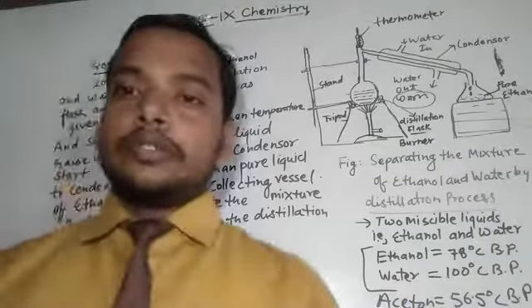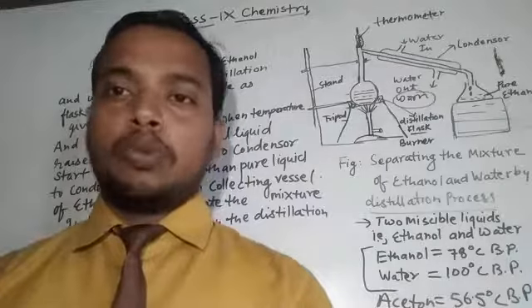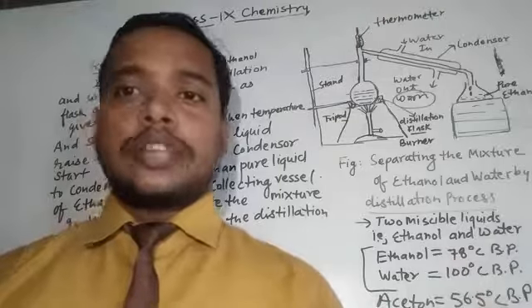So first we take the mixture of two miscible liquids. It may be ethanol and water, it could be acetone and water.